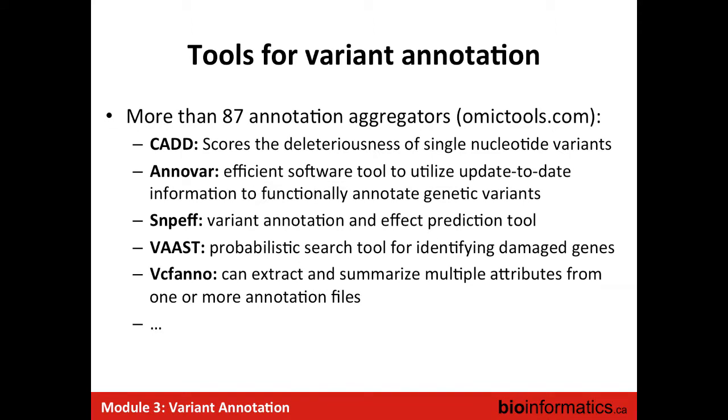So now, a bit of a challenge is, I've already mentioned the fact that you want to be annotating your variants with databases, and you want to predict their impact. So do you have to run all of these different tools separately? Thankfully not, because there's a number of tools, including the one that you're going to be using in the practical, that actually aggregate different types of annotation. And so you only have to run one tool to do this annotation.